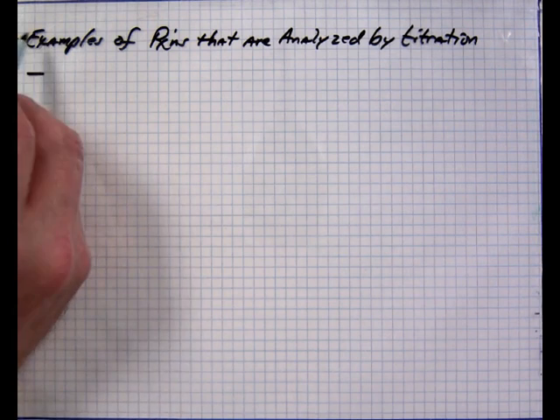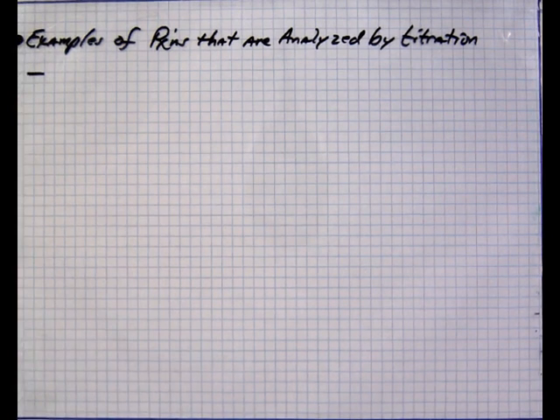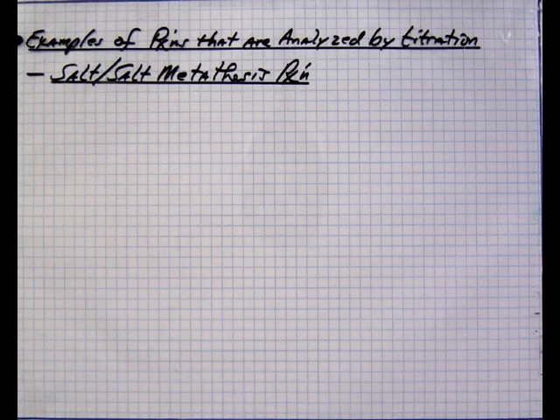Okay, let's look at some examples of reactions that are analyzed by the titration process. First, let's look at the salt-salt metathesis reaction.